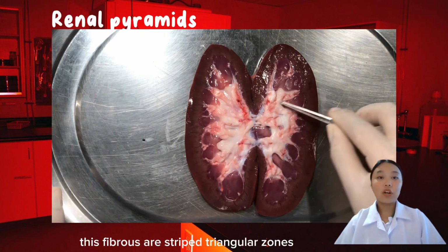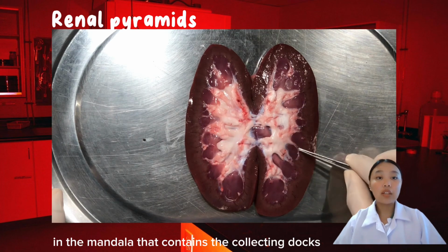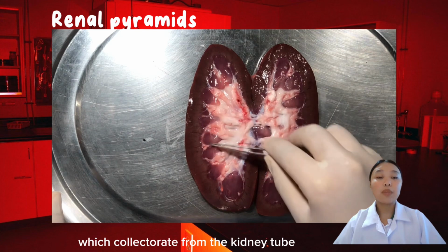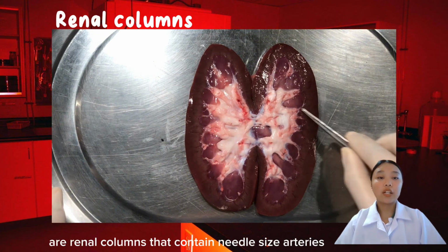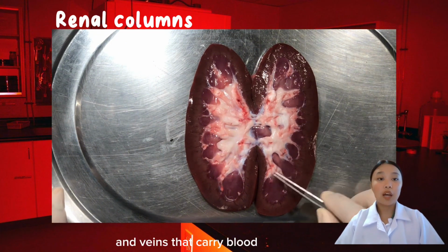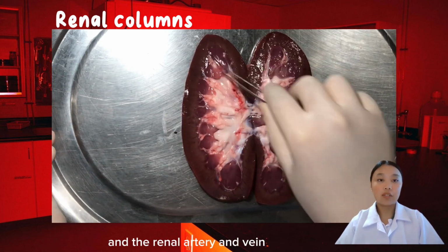These fibrous or striped triangular zones in the medulla that contain the collecting ducts are known as the renal pyramids, which collect urine from the kidney tubules of the nephrons in the cortex. Between the pyramids are the renal columns that contain middle-sized arteries and veins that carry blood between the nephrons in the cortex and the renal artery and vein.